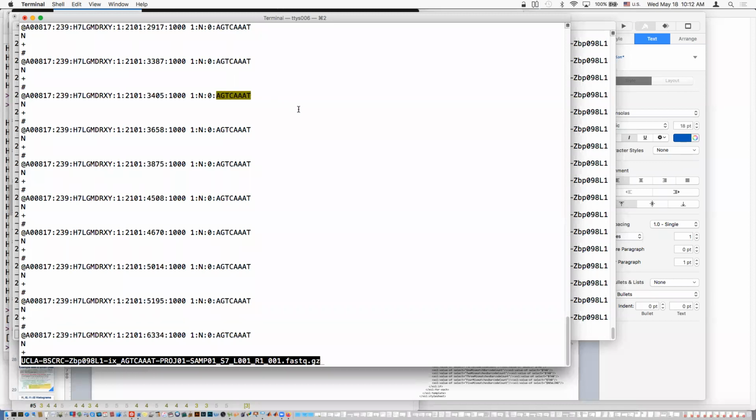So the index read ACGTN discrete base calls are still here. We do have the quality scores aren't here anymore. Why they didn't throw that in, I don't know. But it's too late now. This format is so widely read by so many tools, we'll never change it. But that's the only thing we've lost by not emitting the I1 file. We lost the per base Q scores of the index read. But the ACGTN sequences are here.